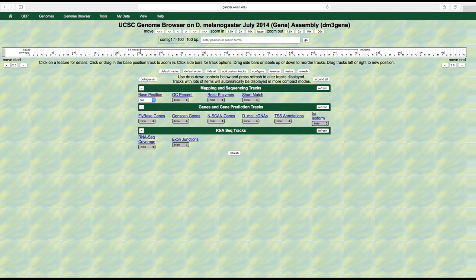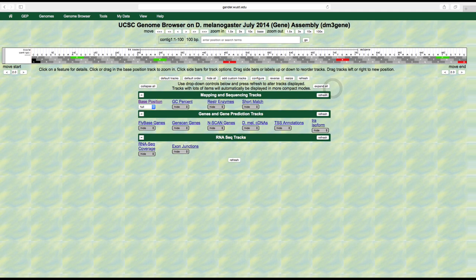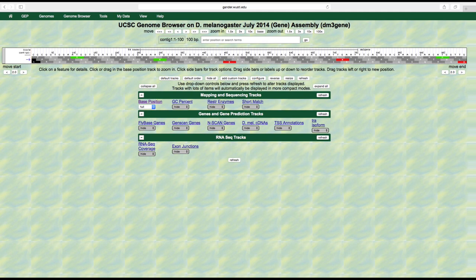Let's change the base position track to full to see more information associated with this feature. Click full and hit refresh. Below the bases we now see gray boxes — these indicate the amino acids that are called for by each codon, or set of three bases. There are three rows of these boxes because there are three possible reading frames depending on which base is used to begin the first codon. The first reading frame starts with the very first base of the sequence, the second reading frame starts with the second base, and the third frame with the third base. For each strand of DNA there are three possible reading frames, so there are a total of six possible reading frames because DNA is double stranded.